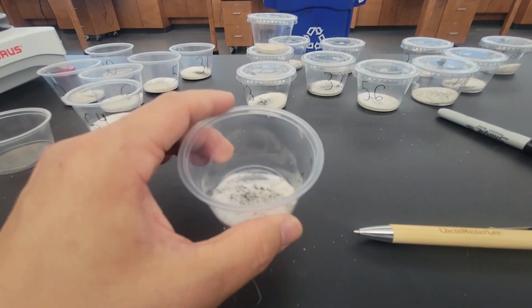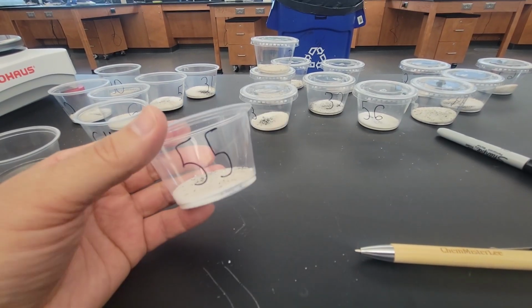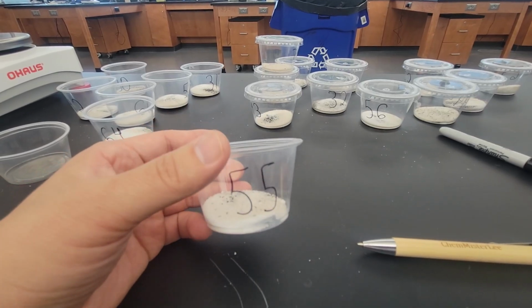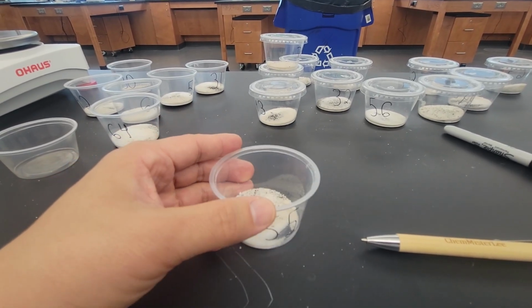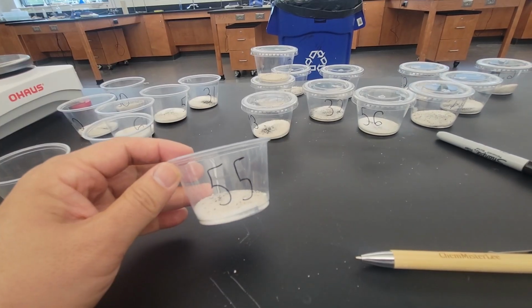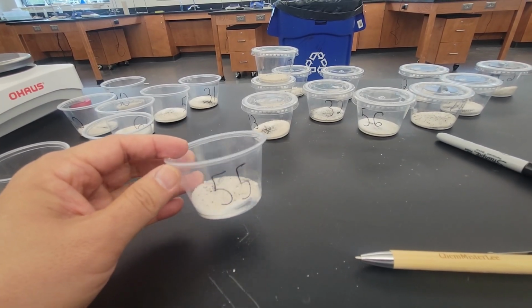And that stuff is recorded in a spreadsheet. We're going to try to separate those three substances using physical methods based off differences in physical properties. So let's see how we can do that.